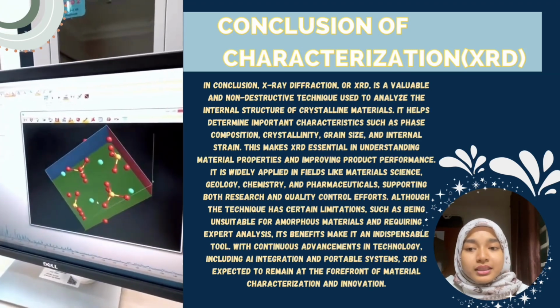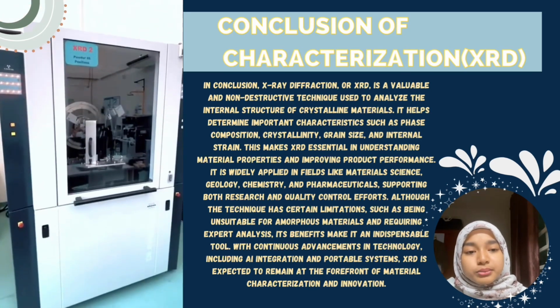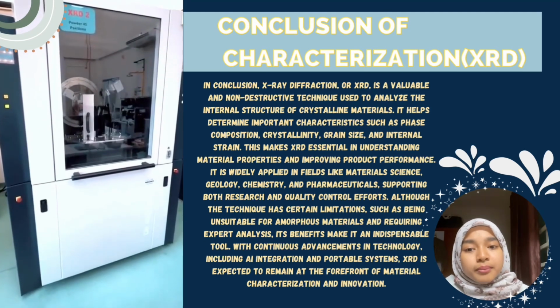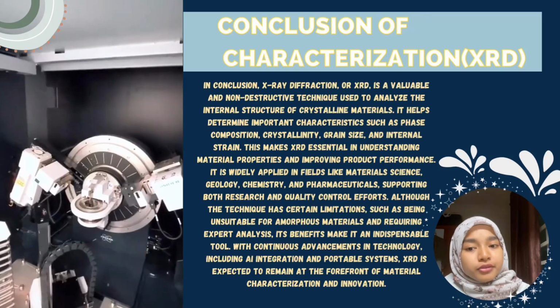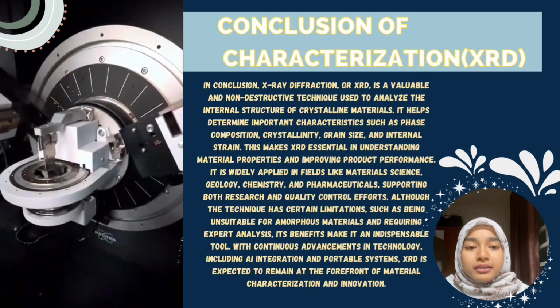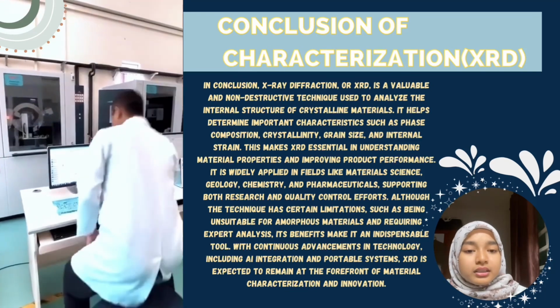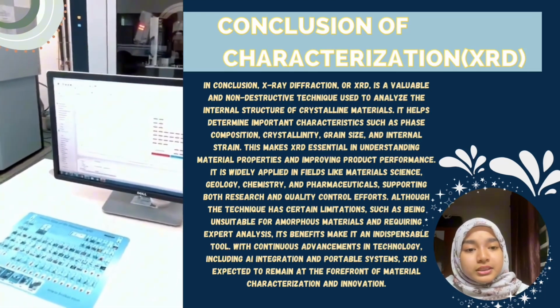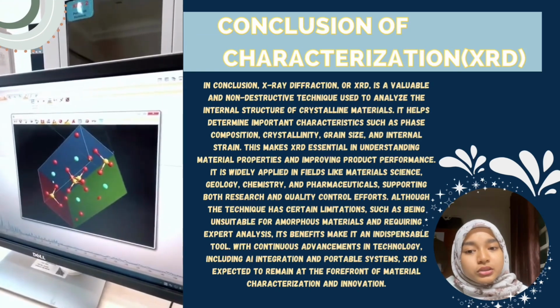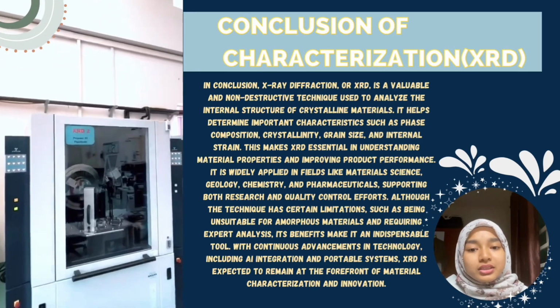although the technique has certain limitations, such as being unsuitable for amorphous materials and requiring expert analysis. Its benefits make it an important tool, and with the continuous advancement in technology, including AI integration and portable systems, XRD is expected to remain at the forefront of materials characterization and innovation.